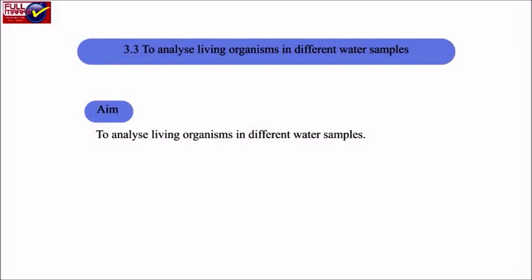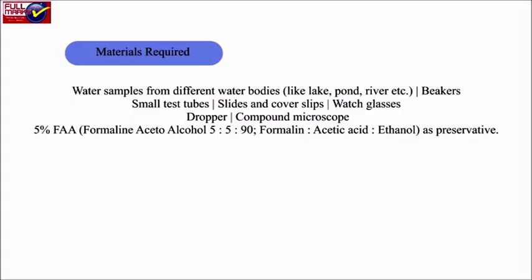3.3 To analyze living organisms in different water samples. Aim: to analyze living organisms in different water samples. Materials required: water samples from different water bodies like lake, pond, river, etc.